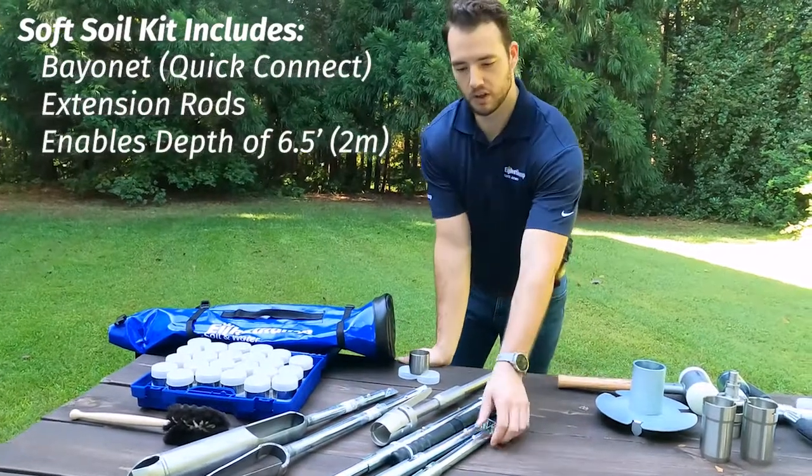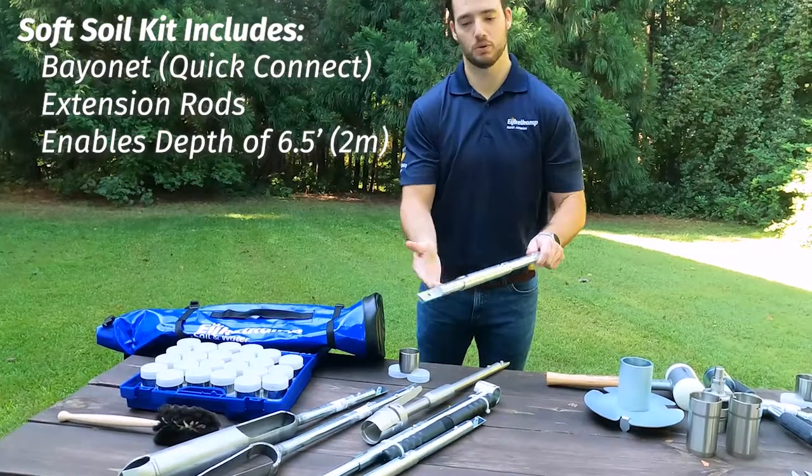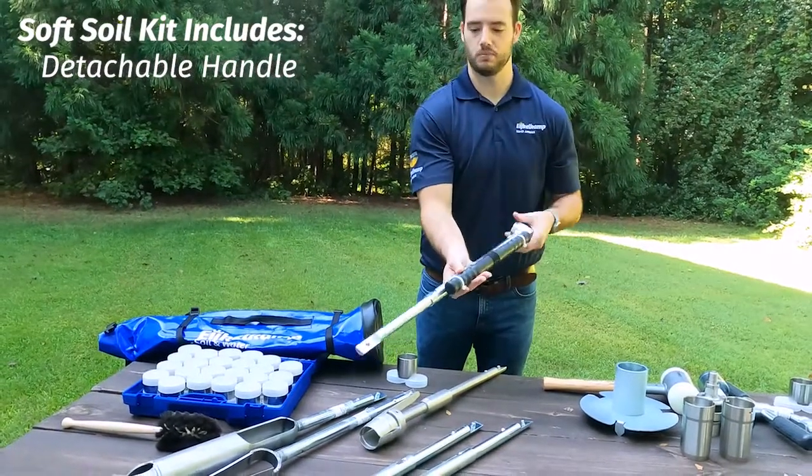On the soft soil kit, this is where it comes with those bayonet style quick connections that will let you go up to about 2 meters in depth. And then we have the detachable style handle that makes it a little bit smaller.